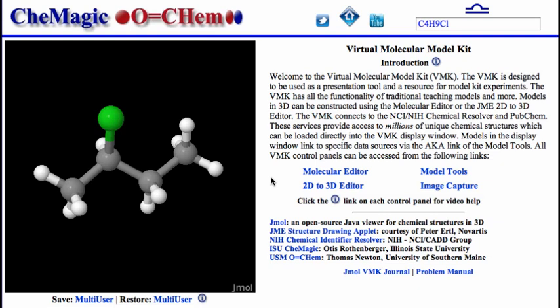Let's take a look at the way the VMK is set up. Every time you load the kit into the browser, you'll start at this page. Note that there are two components to the page: the Jmol display window on the left, and an introductory control panel on the right.